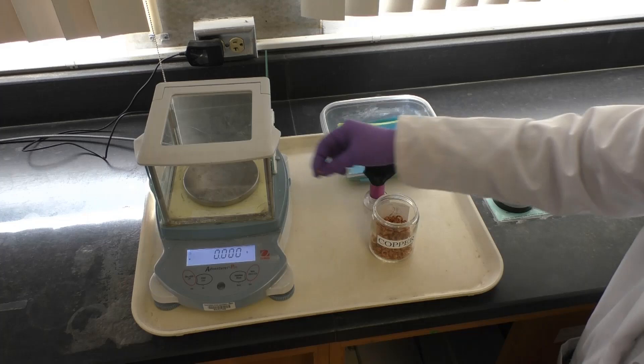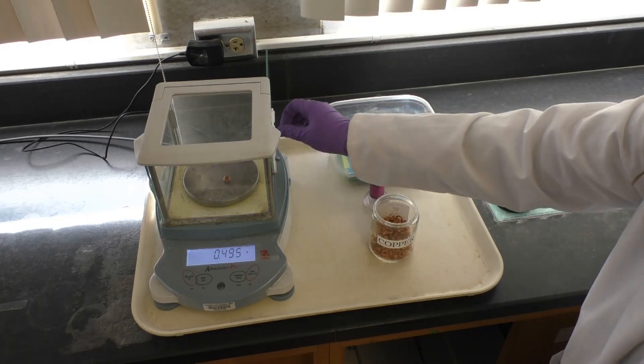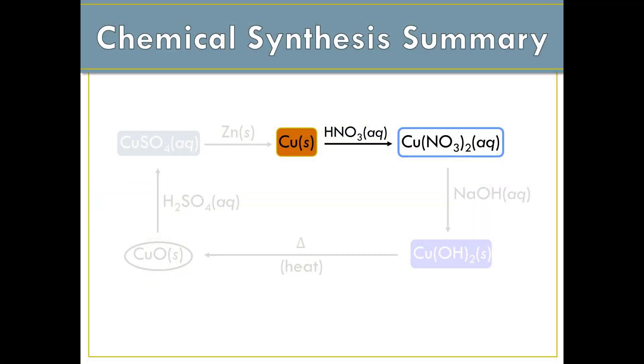Begin your synthesis by weighing out a piece of copper coil to three decimals. The first reaction of our synthesis is to form copper-2-nitrate by reacting your copper sample with nitric acid.